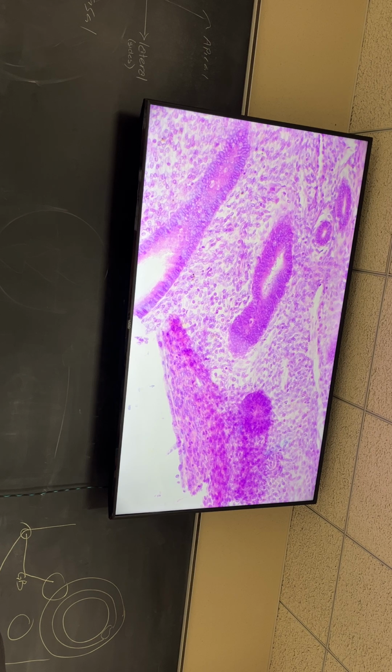Yeah, I don't know. None of those are good. I don't like any of them. I think it's supposed to be the bottom ones are your blood vessels, but that's not right. I don't see any good blood vessels there. Well, I do, but it's not labeled. Everybody see the blood vessel on there? The one bottom right corner. Kind of like right here. There's a little line right there, see that? Yeah, there's one over here too. I'll take it.